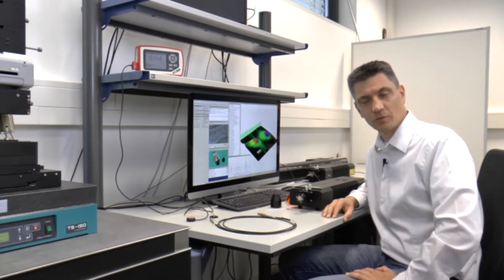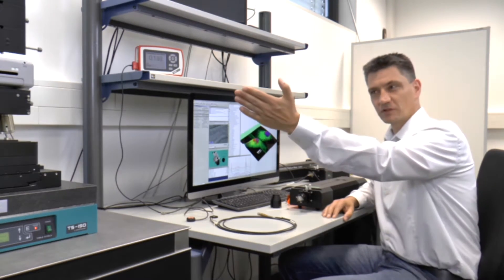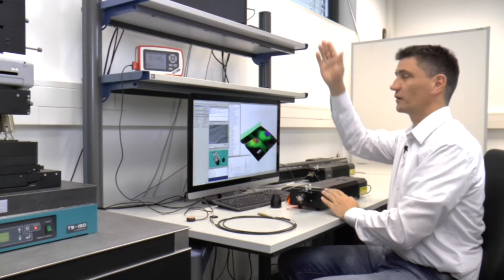In confocal Raman microscopy you always have to in some way couple the microscope itself with the laser and the spectrometers.